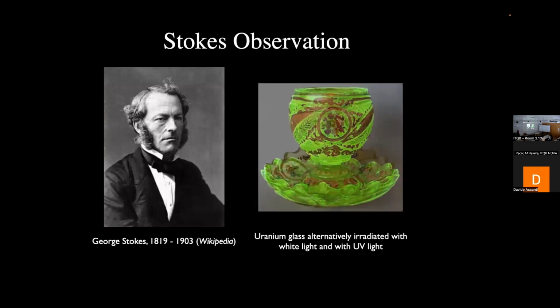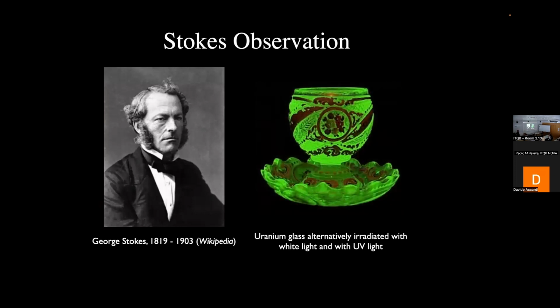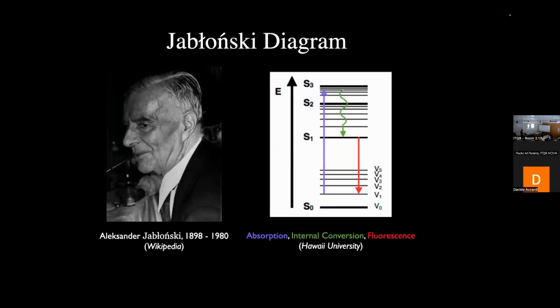But Jablonski was the first one who described in a Nature paper the process of excitation of these few substances that exist in the world that have these fluorescent capabilities, absorbing light of one wavelength and then emitting light of another wavelength. And then you might know this Jablonski diagram, where there are the electrons of the outermost energetic level of an atom or a molecule, that when hit with an appropriate amount of energy, with a certain wavelength, because we know that a certain wavelength corresponds to a certain amount of energy, they jump to a higher energetic level, which is called the excitation level.